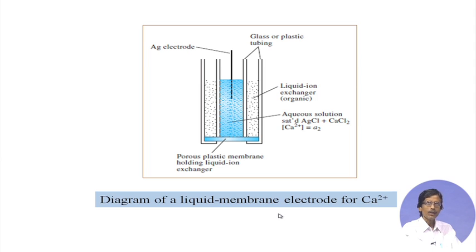The idea behind this measurement is well known now, but the development of these electrodes, and how you measure the potential using these different types of electrodes, is important. Initially, when people developed those electrodes, they were very big and much more complicated, but day by day people are developing them such that we will reach a micro electrode.